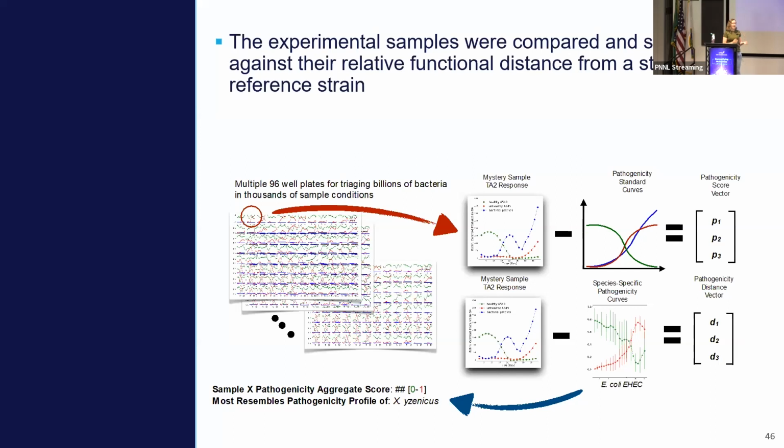also were able to be calculated because, of course, they had positive and negative controls while you're running this. Again, just because you're doing machine learning doesn't mean you shouldn't do the normal things we do in biology and have controls. So they had a flavor of E. coli that is pathogenic, E. coli EHEC. So as that is growing in one of the 96 wells, it's able to be kind of a calibration standard of looking at over time, what are the patterns, so features in machine learning language, of these unhealthy cells that are being seen in the E. coli sample. How do all of our unknowns compare to that over time? Again, it's being used as a reference standard.